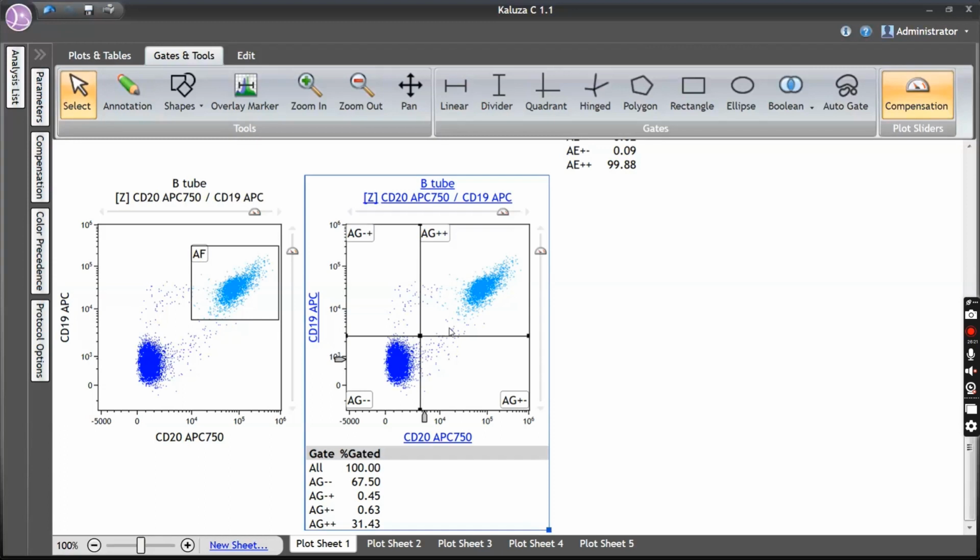If it is only blast, yes, you need to call the intensities by your experience, because you don't have an internal control. But still you can't go wrong. I mean, there may be difficulty in assessing the expression, that is dim, moderate or bright. But there will not be any difficulty in saying whether it's positive or negative. Correct?